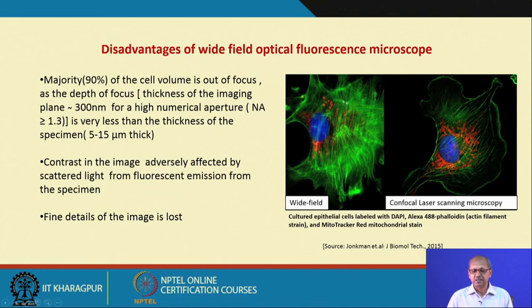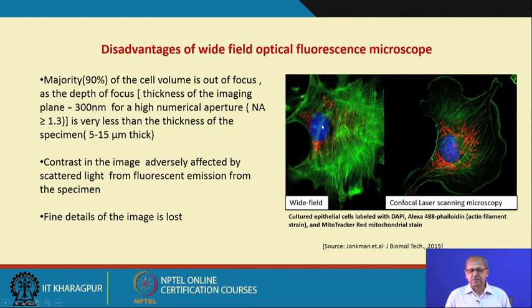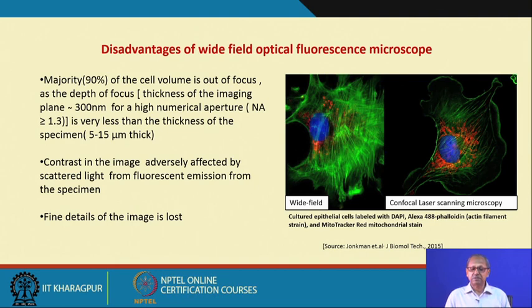As an example, an epithelial cell labeled with DAPI for the nucleus, MitoTracker for mitochondria, and Alexa 488 for actin filaments is shown. This image was captured by wide-field microscopy. For epithelial cells where thickness is very small — around 3 micrometers — the image is reasonable, but if the specimen is 5 to 15 micrometers thick, you get a very hazy image.